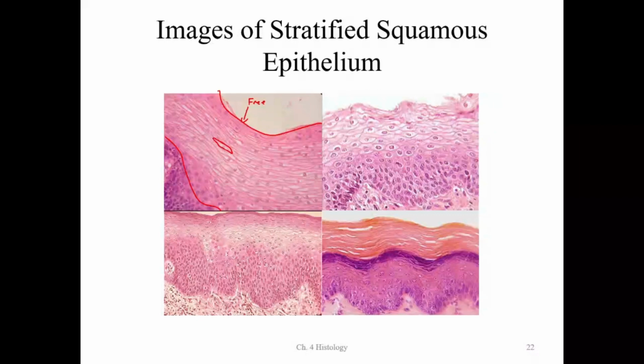At the bottom, they're very boxy. But at the top, as it moves up this way, they flatten out. They're very flattened at the top versus more boxy at the bottom.